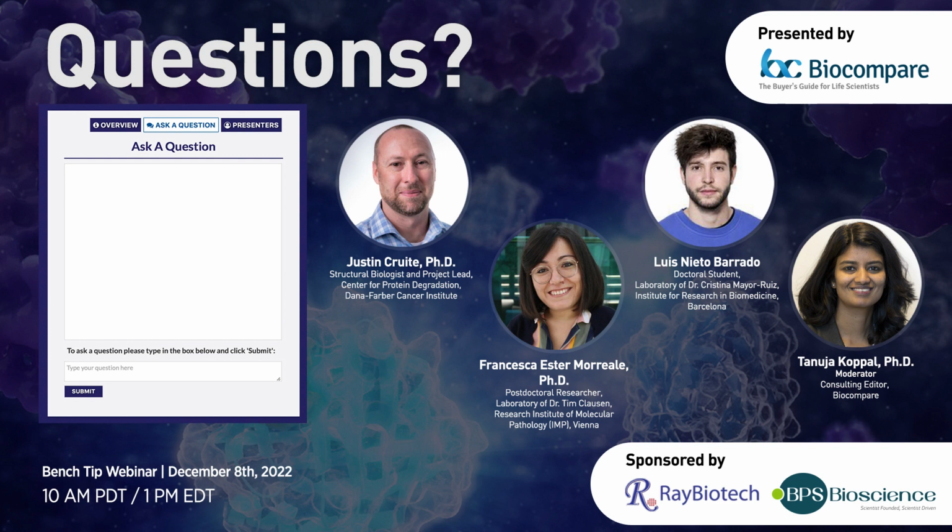So for our group, multiple different assays to address the same question is really important, and also having the right controls. In the degradation field, there are a lot of inhibitors. For every degradation assay and target validation we do, we use either neddylation inhibitors or proteasome inhibitors to make sure we can rescue the effect, and also knock out the known E3 ligase if that is known. These are all very important things to keep in mind.